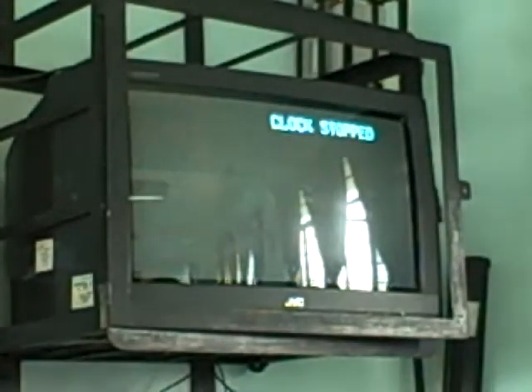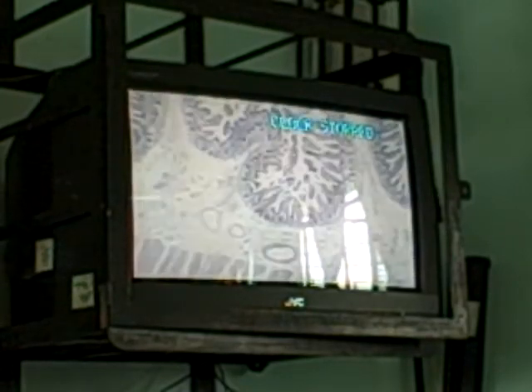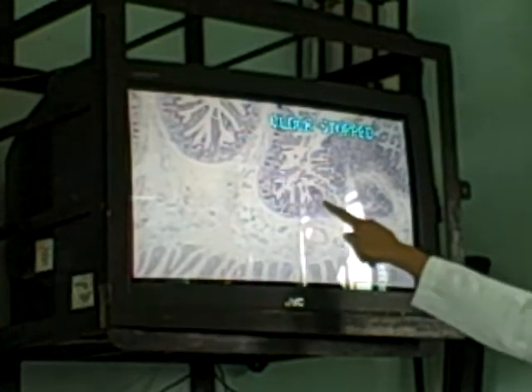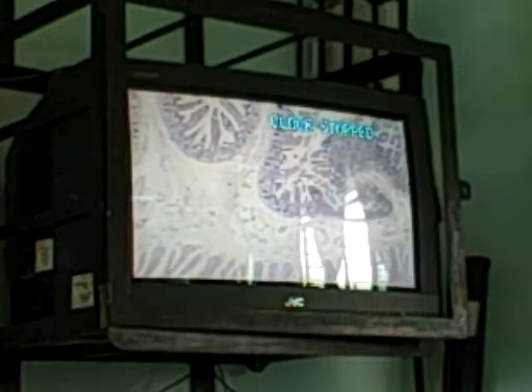Going back to the ileum. Okay, this is ileum. Why ileum? Because I'm going to check for the presence of, what can you identify? Yes, Peyer's patches. This one is a small Peyer's patch. It's only a patch.